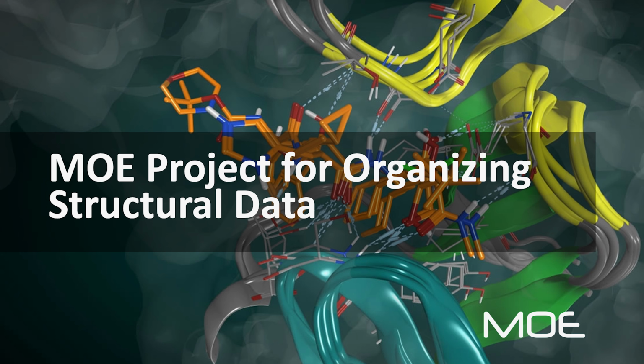Today I'd like to introduce MOE Project. MOE Project is a collection of 3D structures that are annotated and superposed to a common frame of reference. This automates the complex process of organising and standardising structural data so we can share it with project teams to leverage in their structure-based drug design.